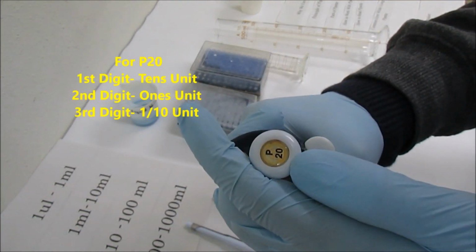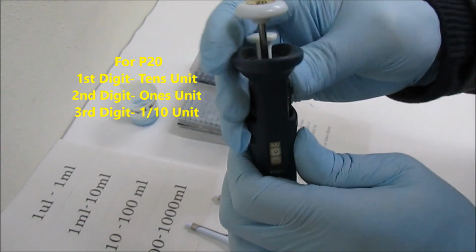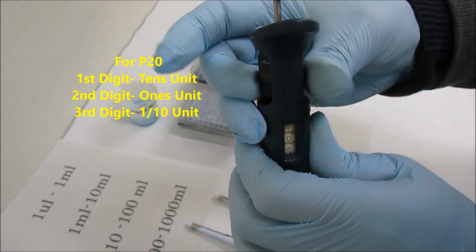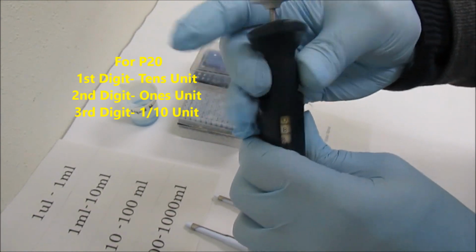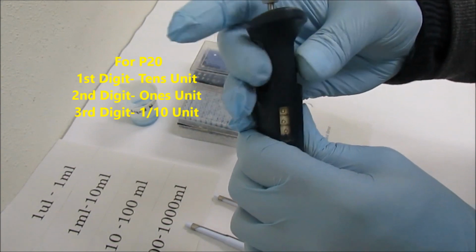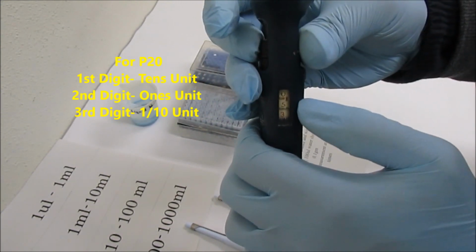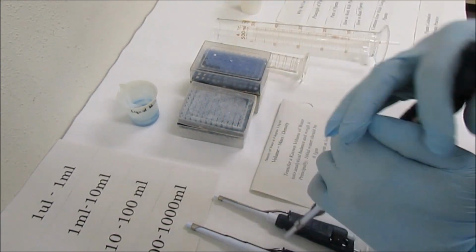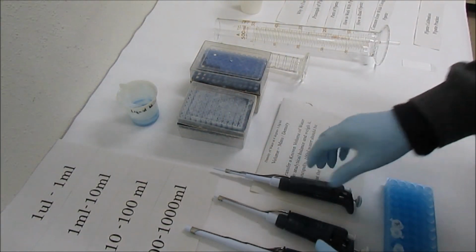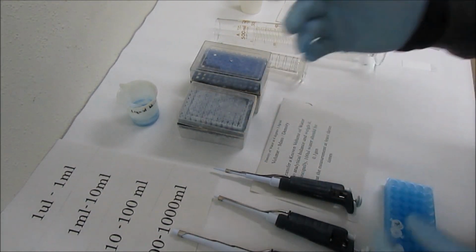So this is 20, which means the first digit refers to the tens. So this is 10, right? Now this is 10 microliters, and this is 6 microliters, because the second digit refers to the ones. So this is the basic concept: whatever the maximum volume of the pipette, the first digit corresponds to that number.